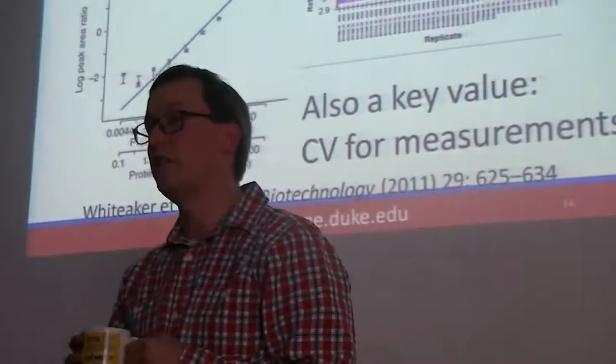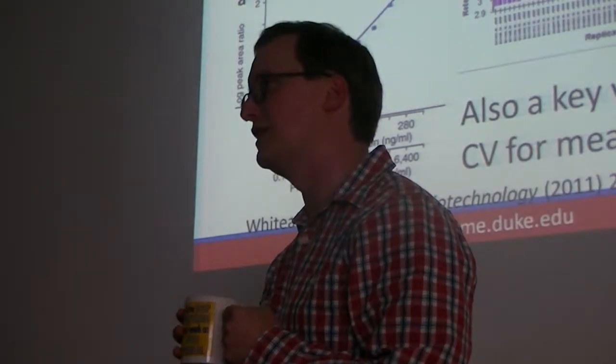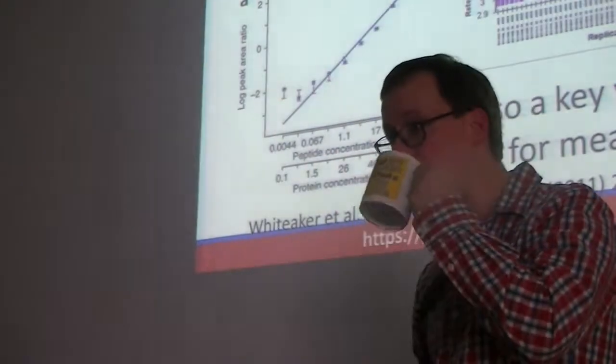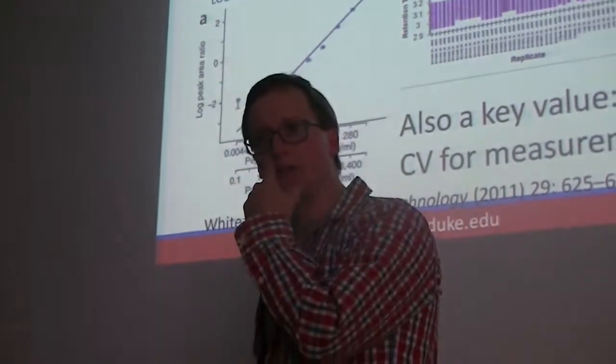All right. There are quite a few kinds of plots that show up here. And some of these are quite useful in understanding lots of technologies, and I would like you to understand them. So on the left, I have a calibration curve. A calibration curve is quite essential anytime you're working with a quantitative technology.